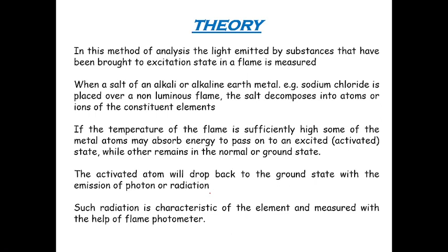So what is the theory? In this method, the analysis of light emitted by the substances that have been brought into excited state in the flame is measured. You know that you have molecules, and those molecules will be converted to atoms, and atoms will get into excited state, and when they come back, they will emit radiation of the characteristic wavelength. So when a salt of alkali or alkaline earth metal, sodium chloride, is placed over a non-luminous flame.